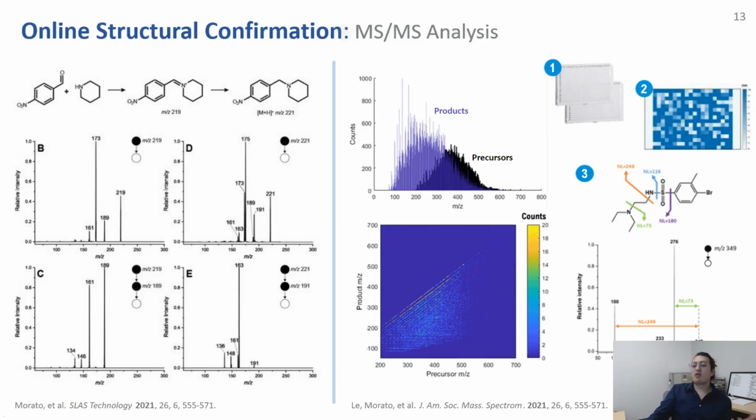Now, what if you want to acquire spectral libraries? Because that's very useful if you want to do metabolomics or you want to do untargeted identification of compounds and so on. But you need these libraries to be able to compare a spectrum. And usually those are tedious to make because it will take forever. But what we did is take a 20-something-thousand compound library, put them on the plates, and then screen them, acquire MS/MS spectra from all of them very efficiently.